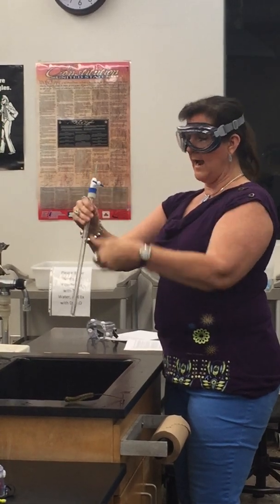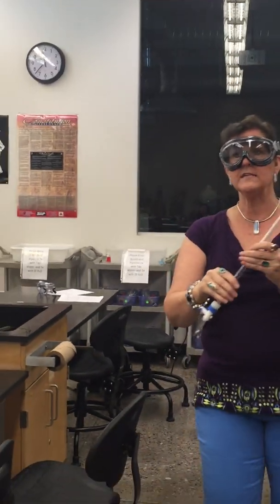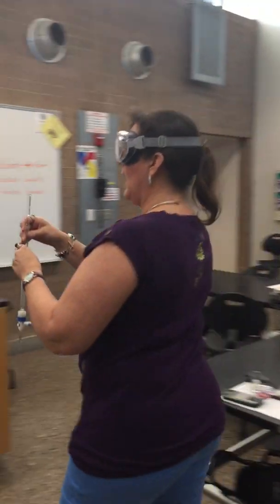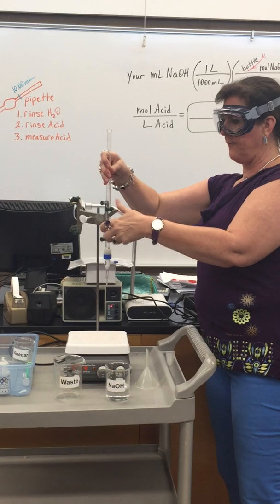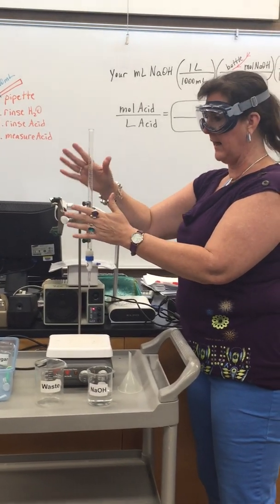Now the inside of the burette is coated with distilled water. Bring it back and clamp it in the burette clamp. Be careful — if you break this, you bought it. So be very careful.